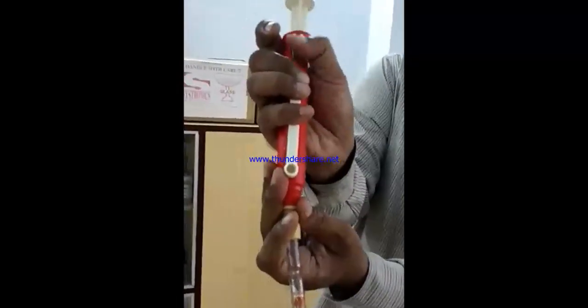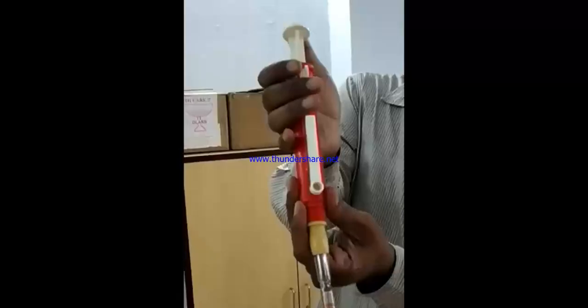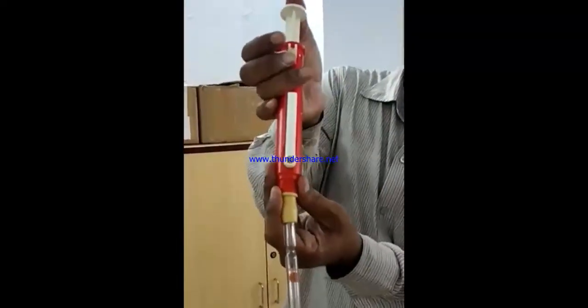These are the markings. This is a 10 milliliter pipette. 1 milliliter marking at each point is there: 1, 2, 3, 4, like that up to 10. We are taking 1 milliliter of MnSO4, manganese sulfate. We will add it into the BOD bottle sample.